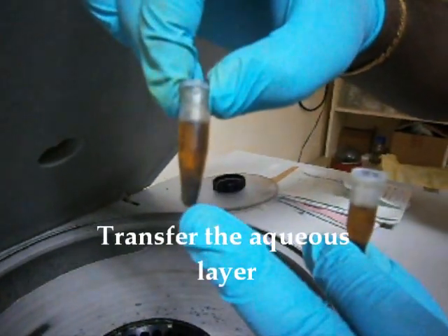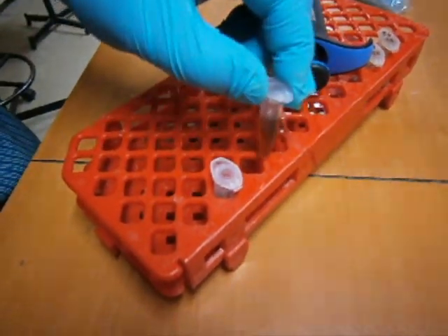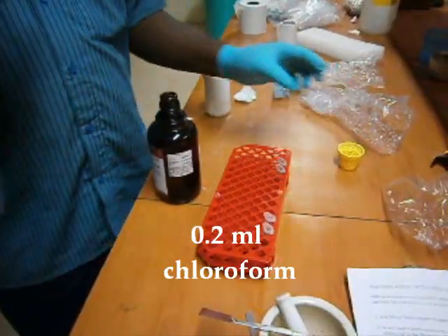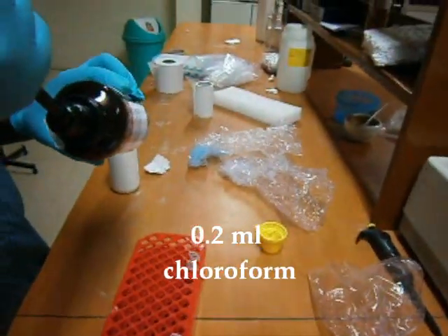After centrifugation, the supernatant was transferred into a fresh Eppendorf tube. Utmost care should be taken not to contaminate the supernatant with the pellet while transferring it. Next, 0.2 ml of chloroform was added to the supernatant.